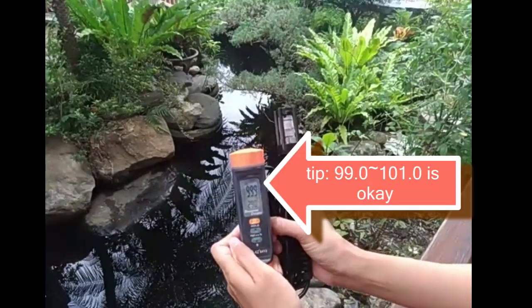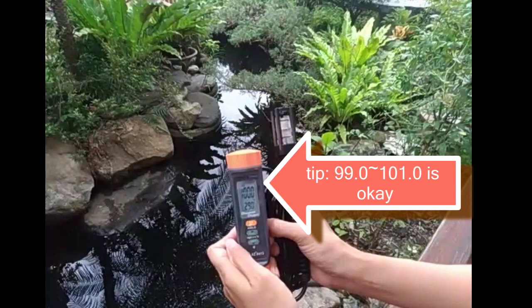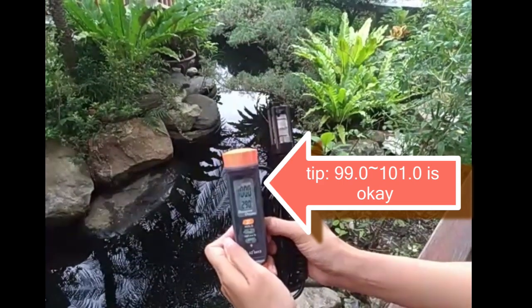After calibration, the displayed value should be between 99.0% and 101.0%.